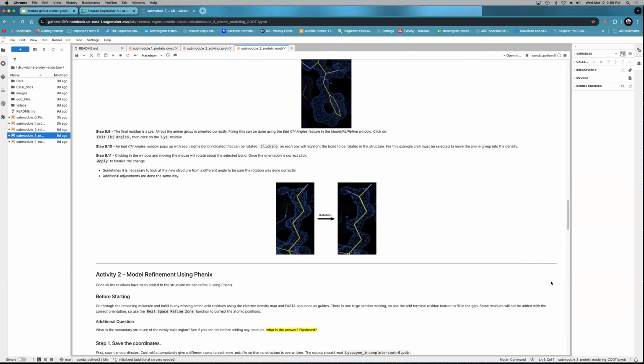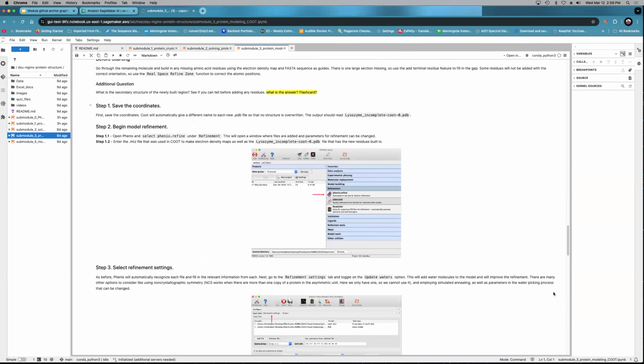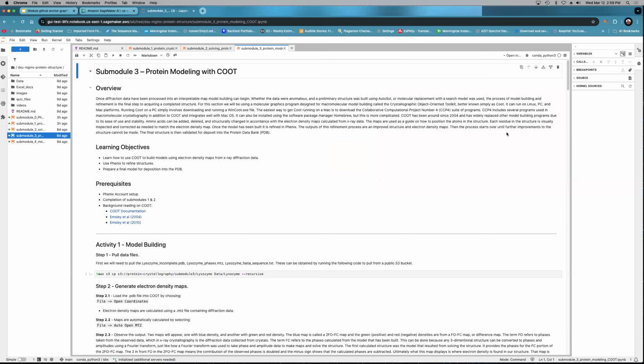So what we'll be doing is just learning some of the tricks that are involved in doing crystallography. There's some theory in here explaining more or less how it works. And by the end of this, you should have a handle at least to get started doing crystallography in your own lab. Ultimately that's the goal of the modules, so that if you don't have a lot of experience doing this, you can gain some quickly, and also have access to software that will work right away.